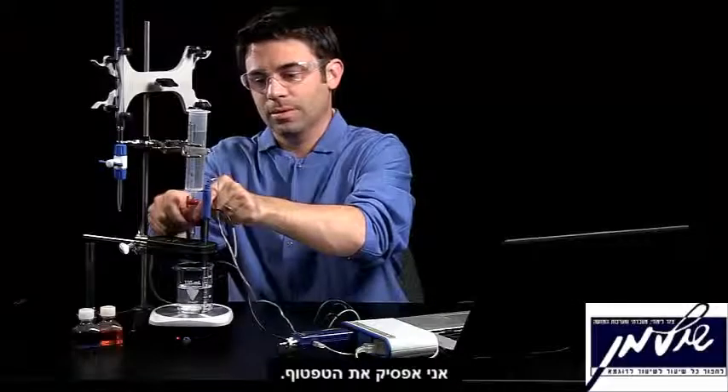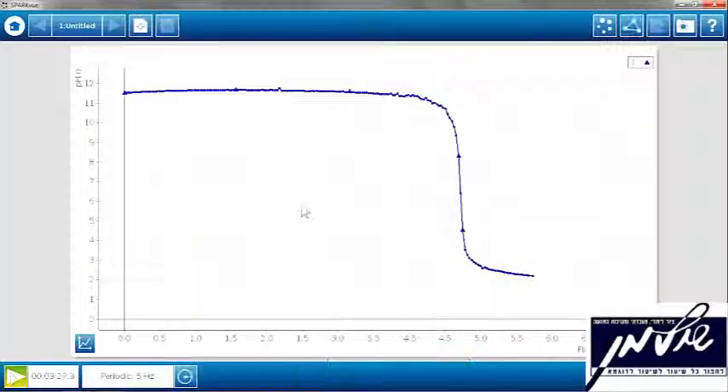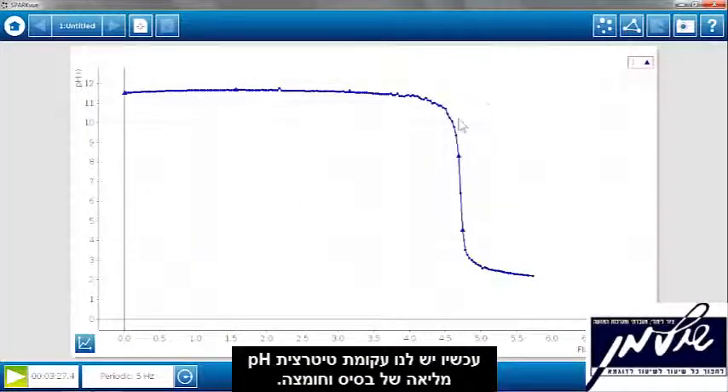I'm going to turn off the drop dispenser and stop data collection. Now we have a textbook example of a pH titration curve of a strong base with a strong acid.